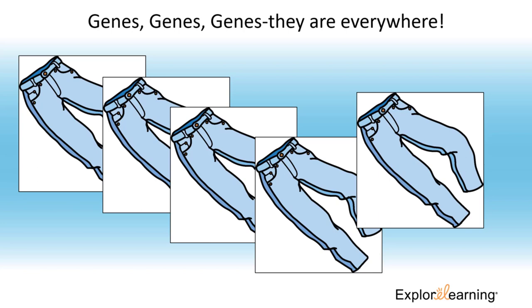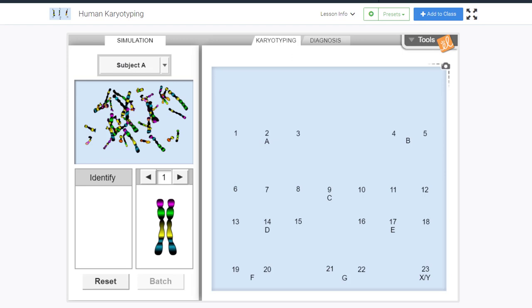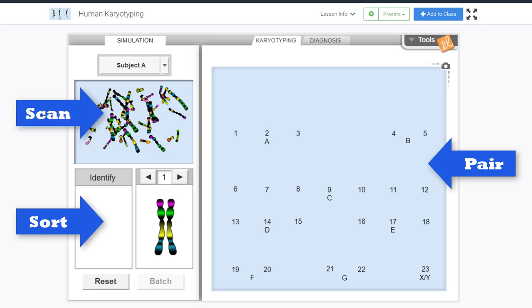Genes, genes, genes. Who doesn't like a good pair of genes? In the human karyotyping gizmo you can learn to sort and pair the images of human chromosomes obtained in a scan.